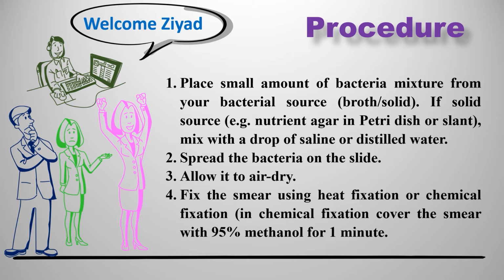on a slide. And I would prefer that you make a black circle, so all your work will be in this black circle, and this will make things easy for you, and you can visualize where you are working. So if you have it in a broth, that means it is liquid, there is no problem. You just need one drop, and then you spread this drop on your slide and go to the second step.